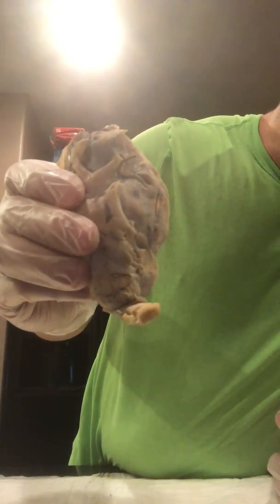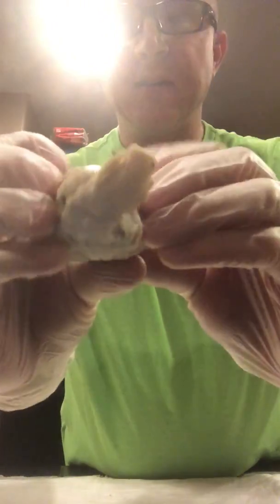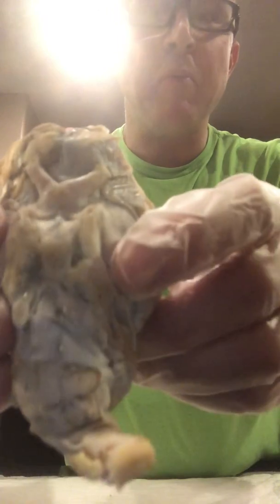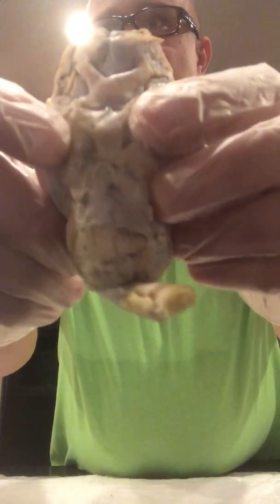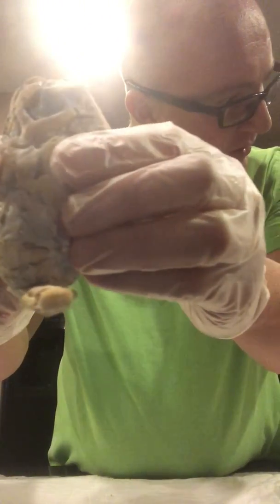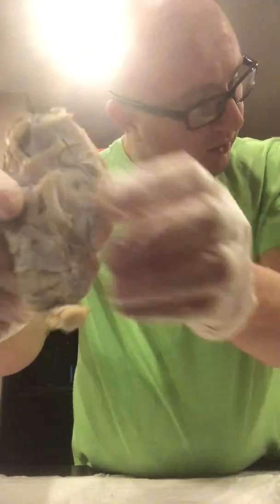The trochlear is going to be roughly right there. It's going to be just below the oculomotor, roughly. The trigeminal is going to be right on the other side. So you have the trochlear on one side, essentially, and the trigeminal on the other.